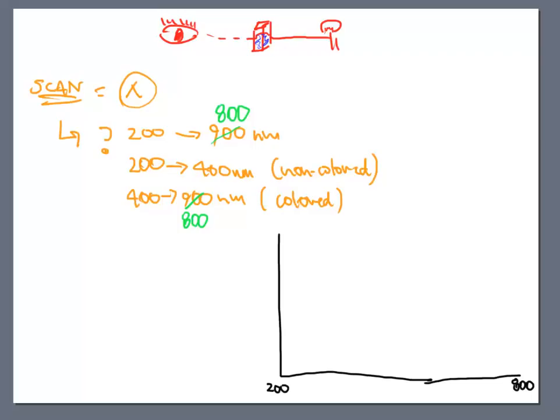And the machine says, okay, fine, I'll do it, not a problem. Give me a couple of minutes, I'll go through the entire window, and I'll get back to you when I'm done. Okay, so let's say in the beginning, nothing really happens. So I just start to see a flat line that shows up on the computer screen.